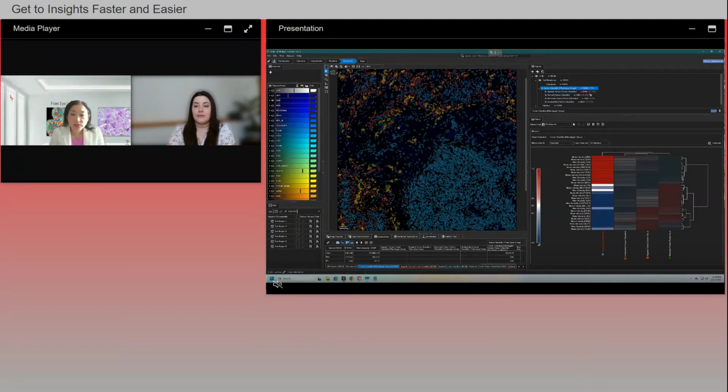It's a great question. For this first iteration, we have built in the ability to handle different sizes automatically, without an option for the user to adjust the size range. In the next iteration, we'll allow users to adjust the size range, but for now, we can handle a small amount of size variation in an image simply by painting. The minimum requirement currently is 5. And we recommend users paint the smallest cells, the largest cells, and the average size cells to give us a range that we can work with. Great question.